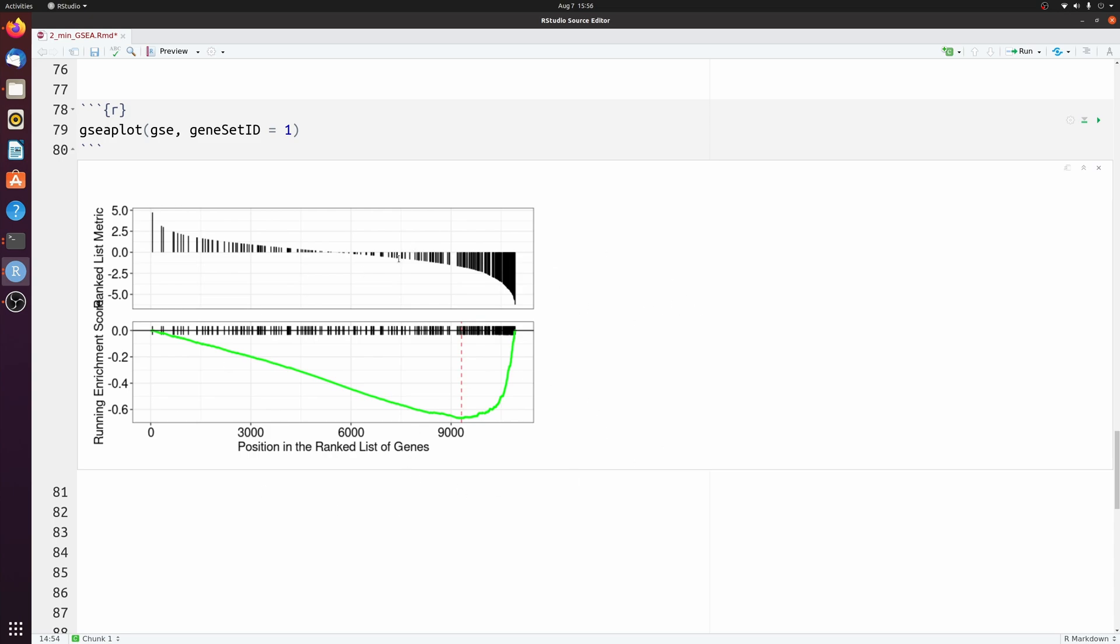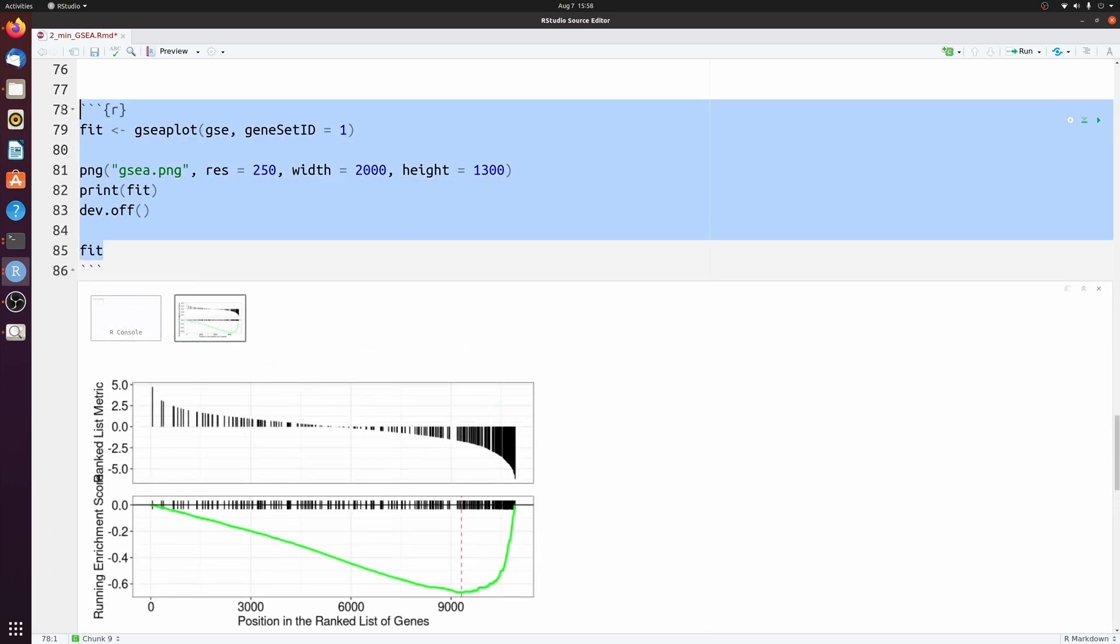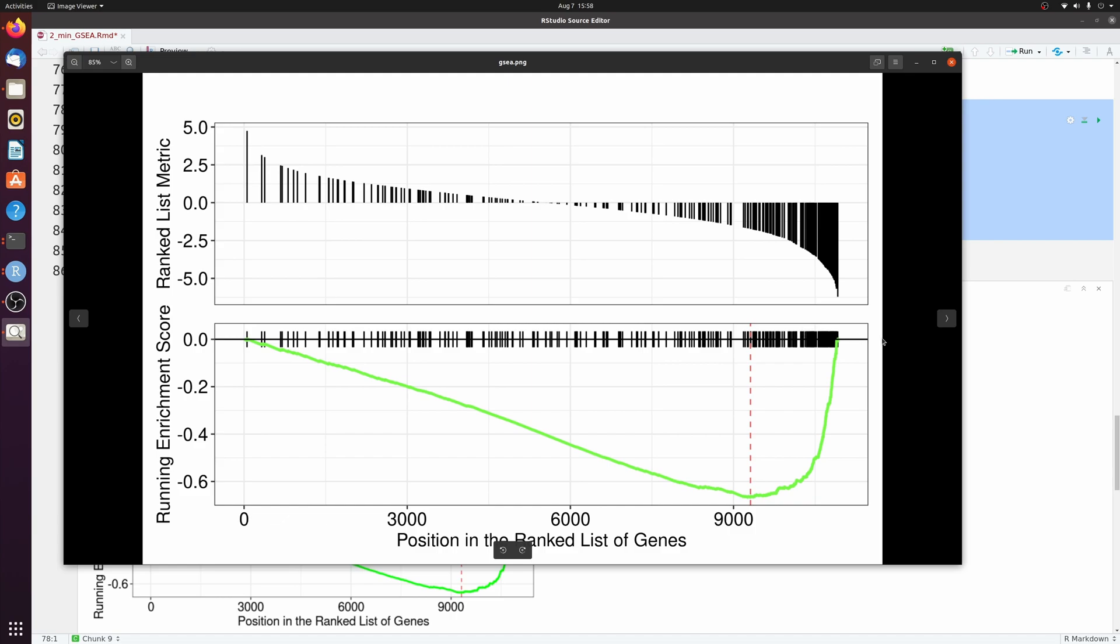Now you can save this to file if you wanted to. Which would look something like this. And then in the end you get this nice looking GSEA plot.